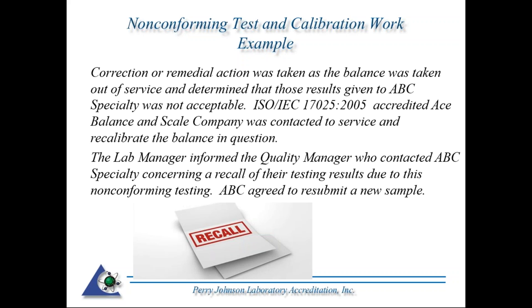So again, we talked about correction and corrective action. In this case, correction or remedial action was taken as the balance was taken out of service and it was determined that those results given to ABC Specialty were not acceptable. ISO 17025 accredited ACE Balance and Scale Company was contacted to service and recalibrate the balance. The lab manager informed the quality manager, who contacted ABC Specialty concerning a recall of their testing results due to this nonconforming testing. ABC agreed to resubmit a new sample. So we have to contact those customers whose work may have been impacted, and if need be, recall those test results.